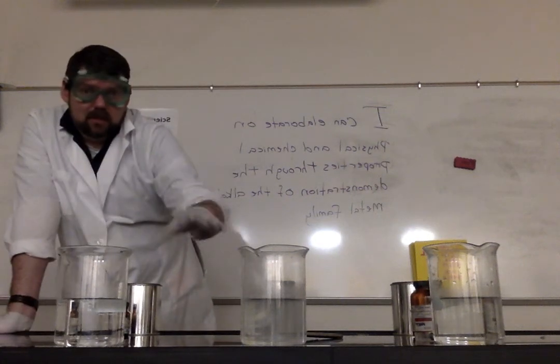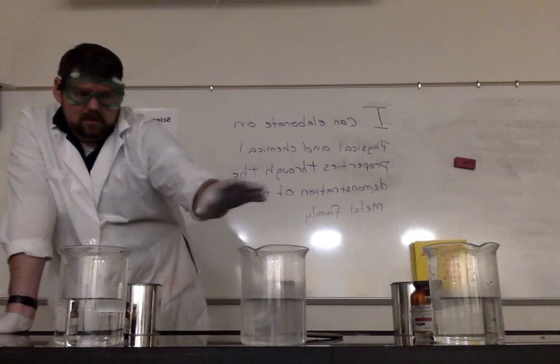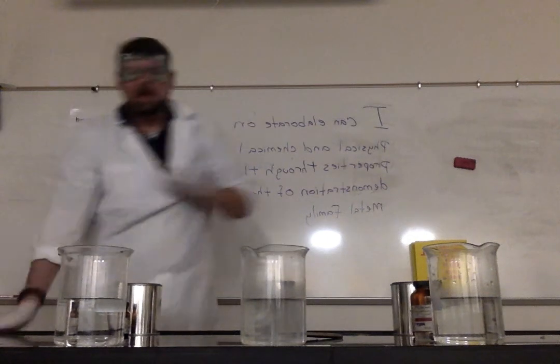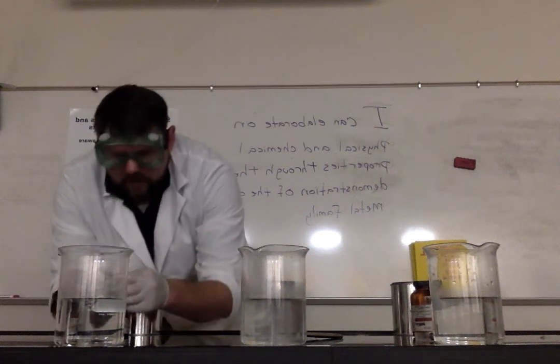So again, pretty cool. We get to see that the item is actually dancing. We see that a reaction is actually occurring. It's not dissolving. It's reacting. I'm getting something totally new. And now finally, this one is kind of fun.